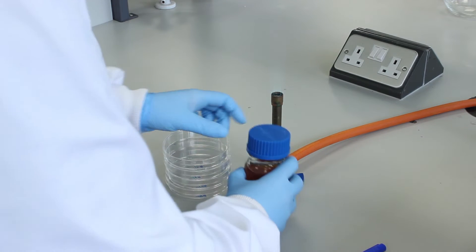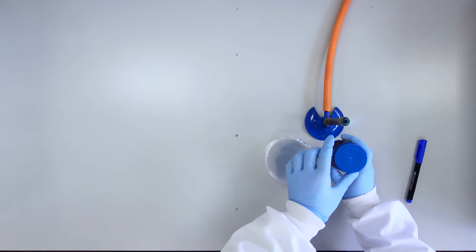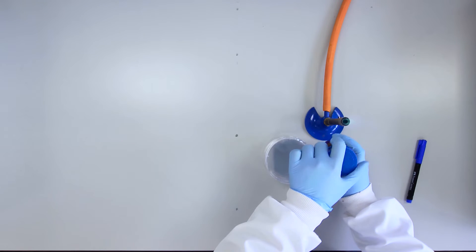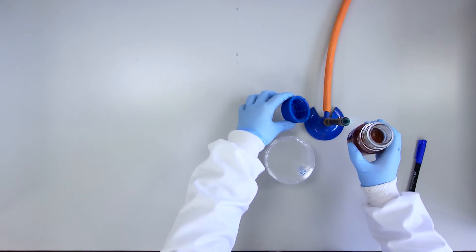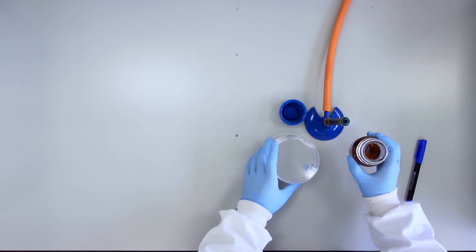Open the bottle and flame the neck of the bottle. Here you can place the cap down with the open side up in the updraft of the Bunsen flame.